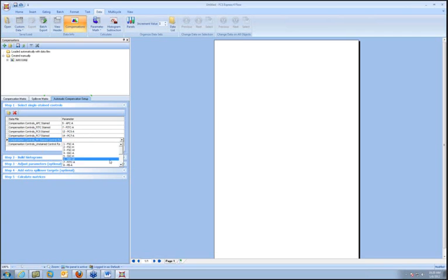And we also have the option, this is an unstained, at the bottom of the list, an option to assign a file as a universal negative. You don't have to choose a universal negative. If you haven't identified any of the data files as a universal negative, it will allow you to pick a negative from every single tube. Okay, so that's fairly straightforward.